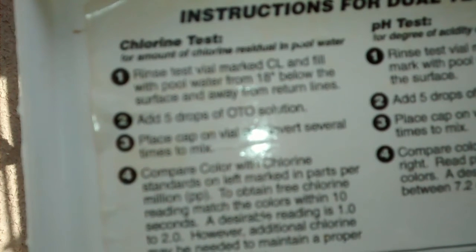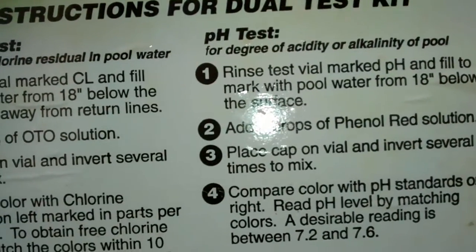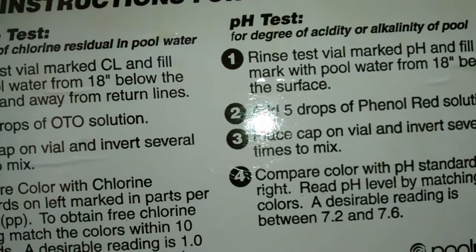Place the cap, mix, and then compare the chart. And the same is true with the pH test — rinse, test, vial, add five drops, mix, and check the scale.